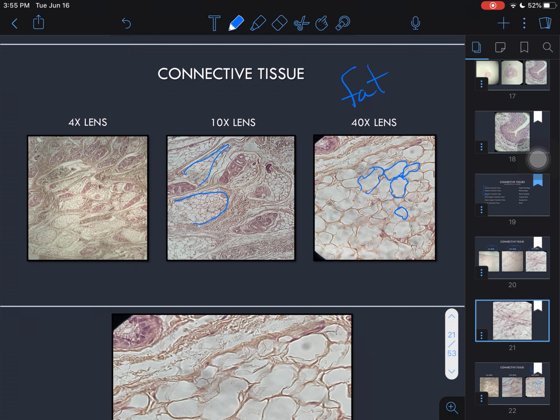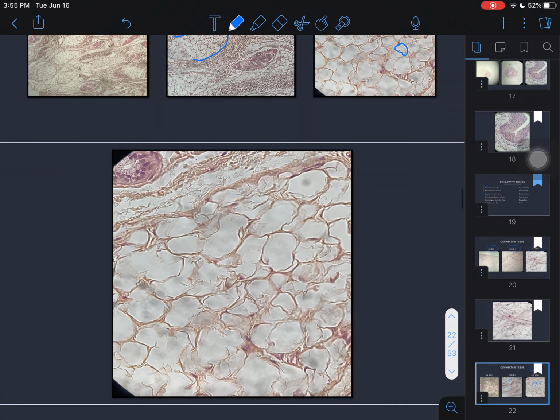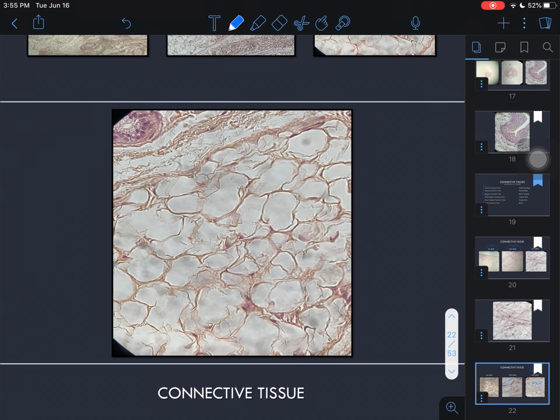they are dead. What's happened is the nucleus of our cells is water based. And what happens with water and oil? It pushes apart, right? So what you'll actually see, if we look down here, is these little sections between the cells where all of their nuclei have grouped together and pushed away from their oily center, their fat center.